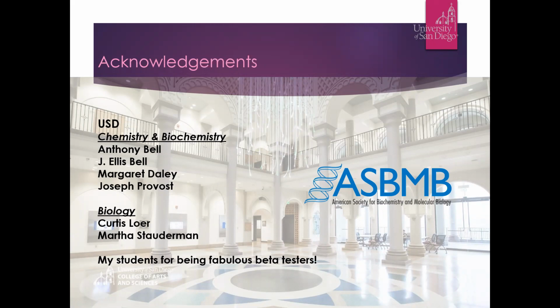And just out of curiosity, have you ever tried to run this lab with and without the SnapGene to see if they have a better understanding of the processes and the techniques? Yes, the first year I ran it without SnapGene, it was really hard. We did a lot of stuff on paper, which they don't like, or cutting and pasting in Microsoft Word. There's freeware called BioEdit that I use. It's only good on PCs though. I tried to show them in that, but the Mac people were quite upset with me. We do have some departmental laptops that are PC that I loaned out to them, but then of course they can't do it at home. So those are some limitations that I had.